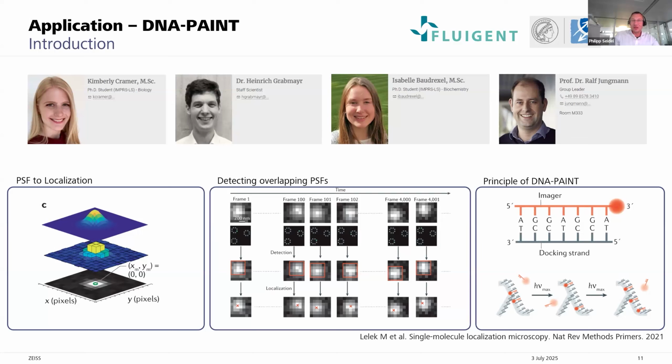So somehow you have to find a way of having those fluorophores switch between active and inactive state, also called blinking. Make sure that with every single acquisition, you only have a subset of fluorophores active, and you will have isolated PSFs. Then you do a lot of acquisitions, a lot of frames, to collect all the random blinking from all the molecules, and you will be able to have a super-resolved image in the end.